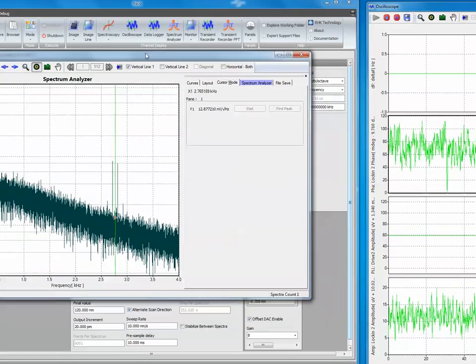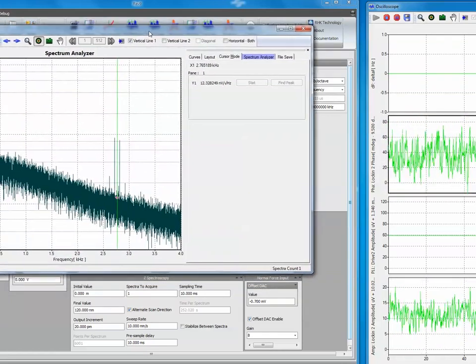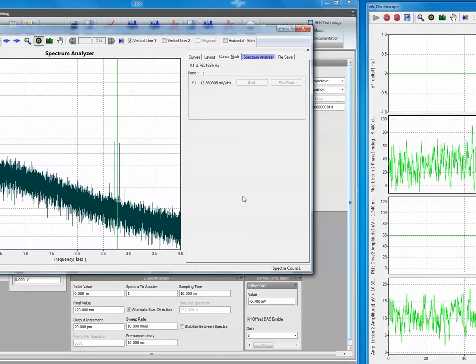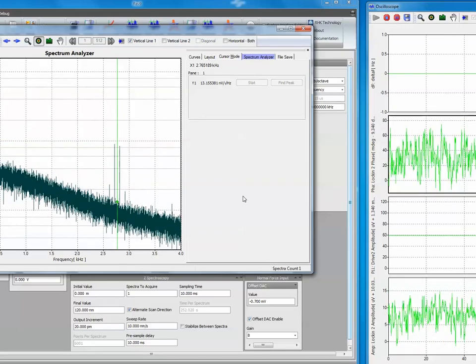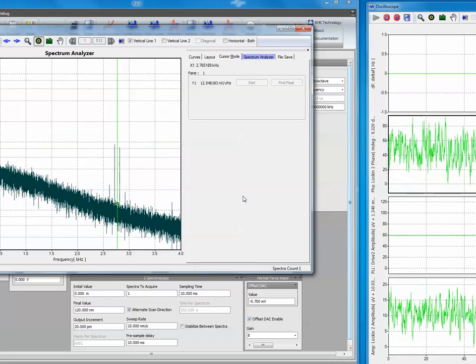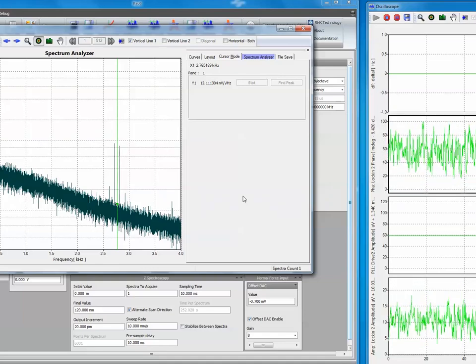This can be done in principle on any cantilever microscope with a resonance lower than 100 kilohertz. If the resonance is above 100 kilohertz, then the R9 has an FIR filter that takes care of this 1F peak, and you don't have to worry about this anymore.